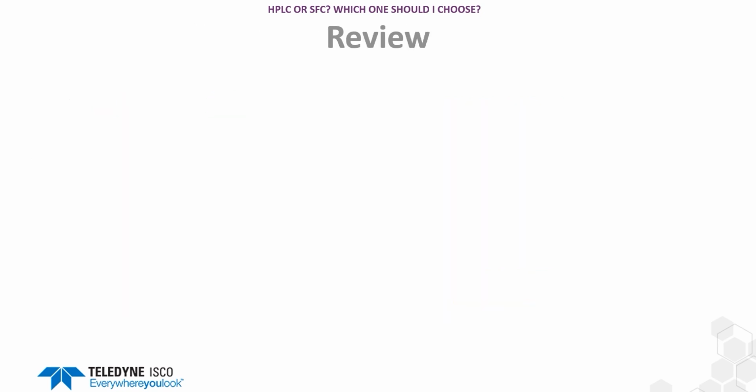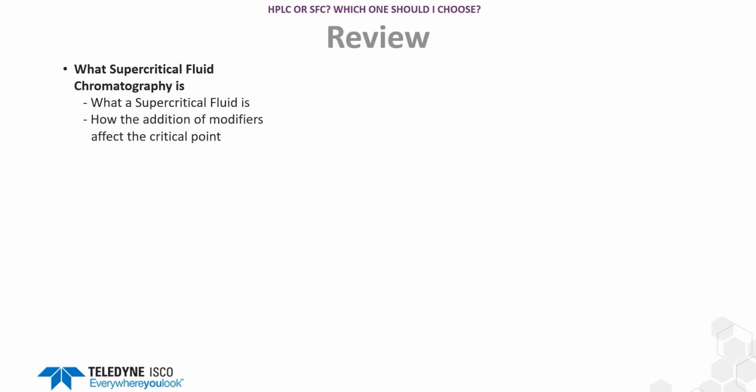So we just went over when HPLC might be favorable over SFC. Now let's review what else we talked about today. We started off talking about what supercritical fluid chromatography is. And in order to answer that question, we had to ask another question, which was, what is a supercritical fluid? So if you remember, we went over that phase diagram and how a supercritical fluid doesn't have those definitive boundaries or that definitive phase change going from a gas or a liquid into that supercritical fluid. We also talked about modifiers or co-solvents and how the addition of these modifiers affects the critical point of our supercritical CO2.